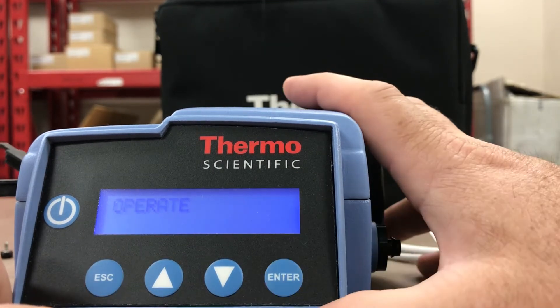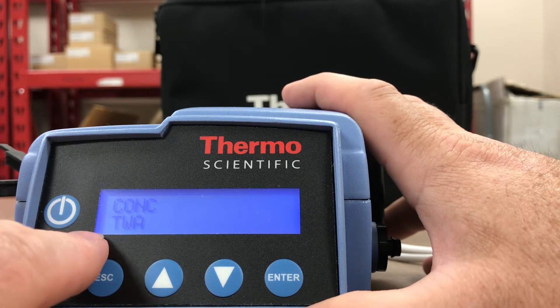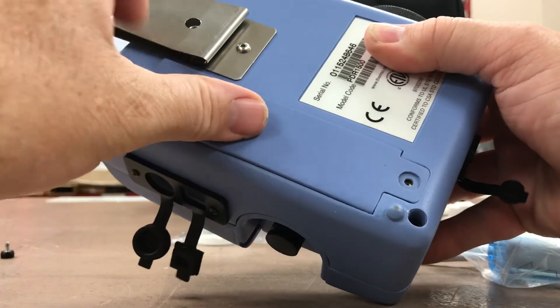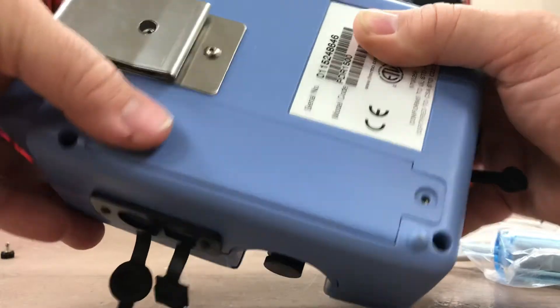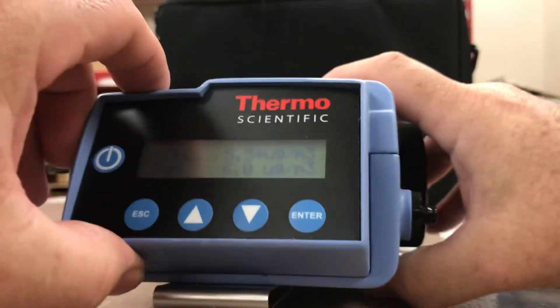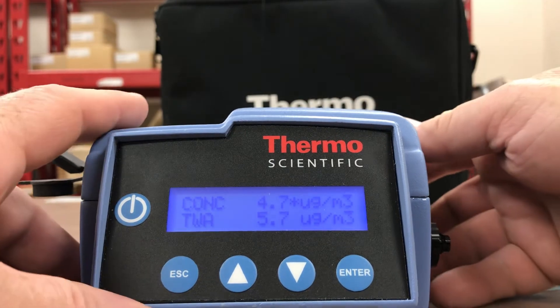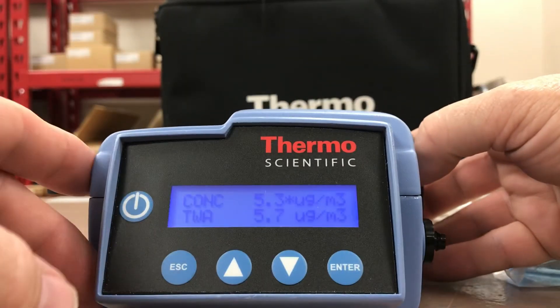So that's the PDR 1500. From the Operate screen, press Enter to Start a Run and it gives you readings in concentration and time weighted average — it starts up reading right away with a very fast response. For the battery pack, there's a plate that closes the bottom to seal the battery compartment, and you can carry it on the belt clip as you're walking around, looking down at the readings on the front. Pressing the Up or Down button lights up the backlight display so you can see it easily. If you have any questions, feel free to comment — thank you.